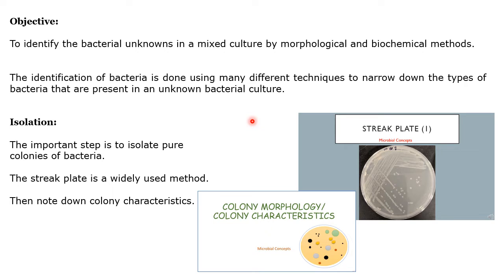For example, let's assume an experiment on isolation of starch degrading bacteria. When you use a soil sample for such experiments, you get 10 to 20 different cultures which are able to degrade, or hydrolyze, starch. In that case you need to identify all of them, and then start studying them. Can I optimize this particular culture? Can I improve the strain and get more yield? That's the reason why we need to identify our culture.